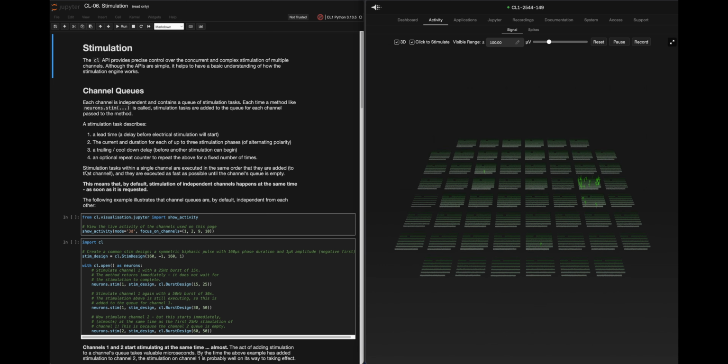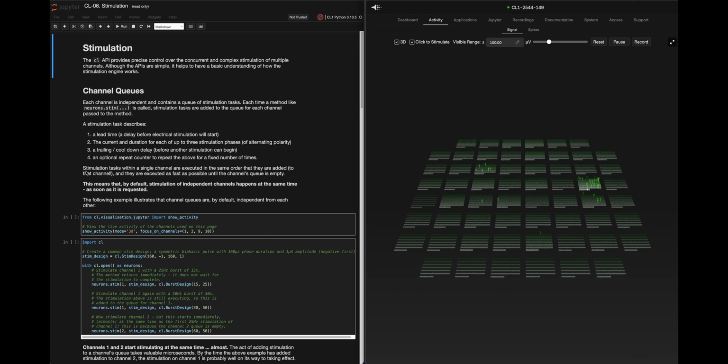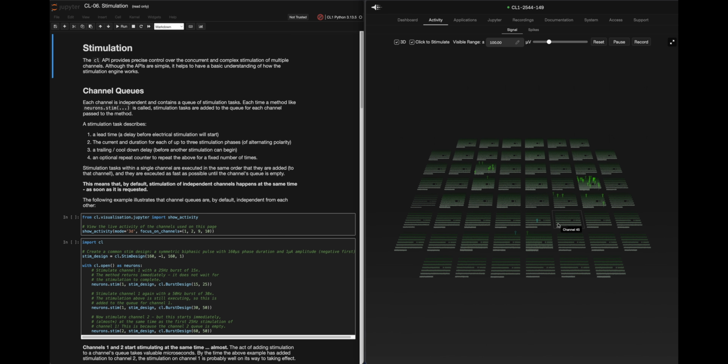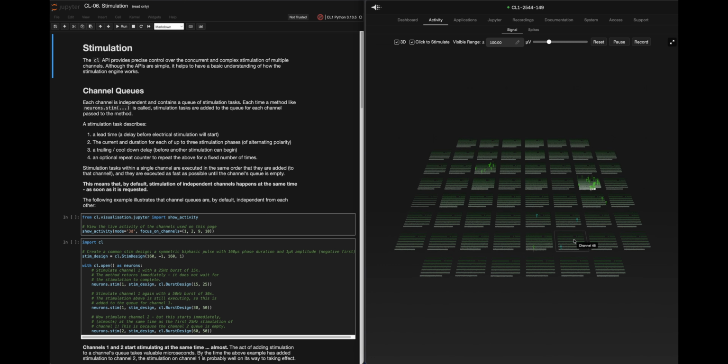One thing that I'm going to make note on here is something that was discovered very early on in the CL1, and this is a tangent. It could be its own video. It's called the free energy principle. So in essence, when you're programming with neurons, they like to move from chaotic, just random. They don't like that. They like, you know, one, one, two, three, two, one, two, three. They like a cadence that's predictable.